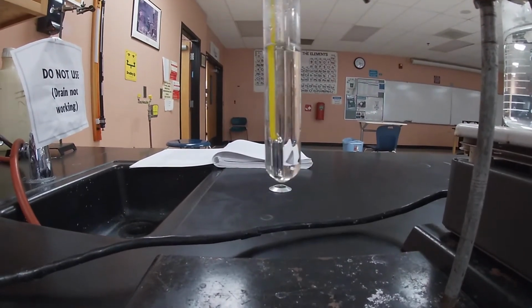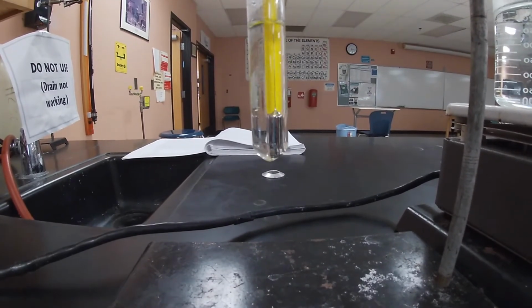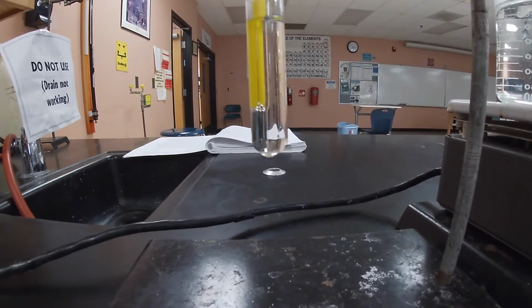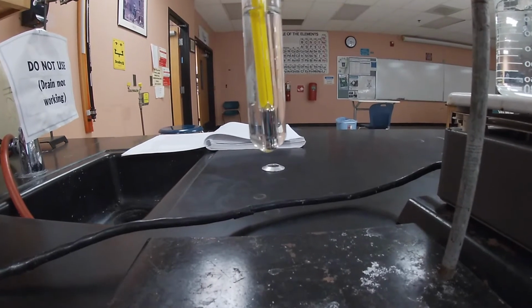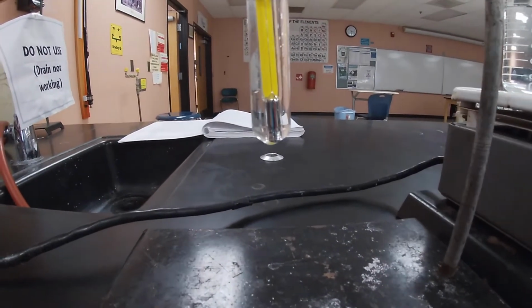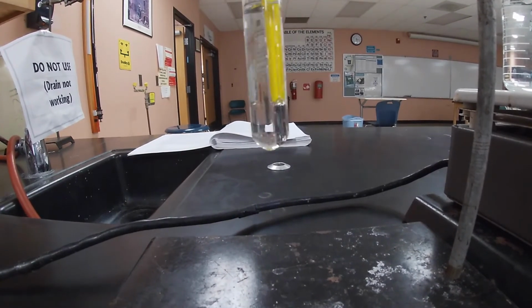Almost there. At about 61. We're at about 60 there. At about 60.